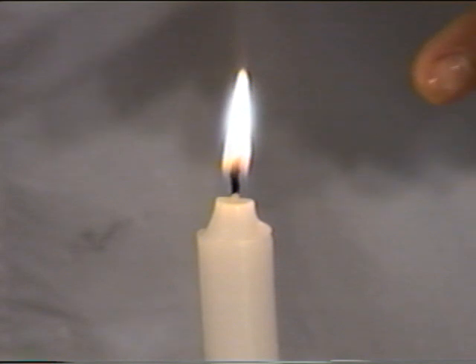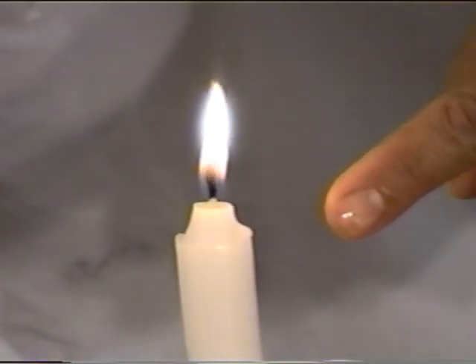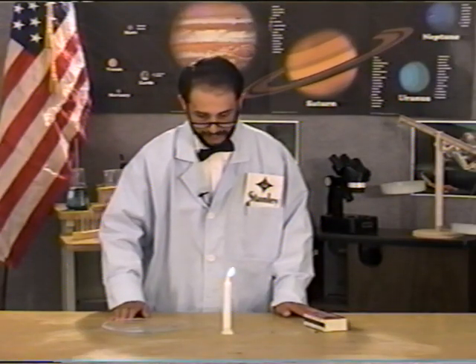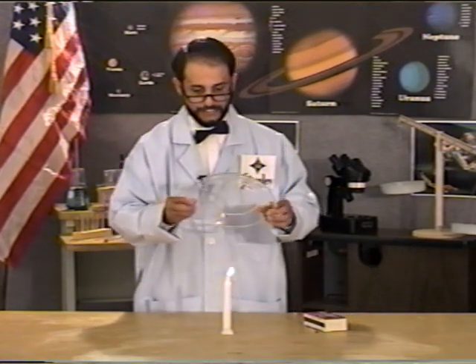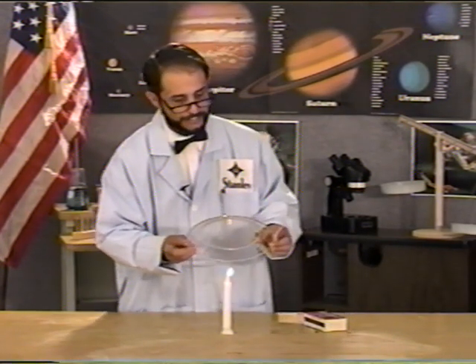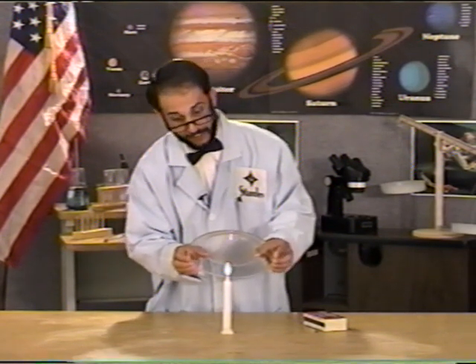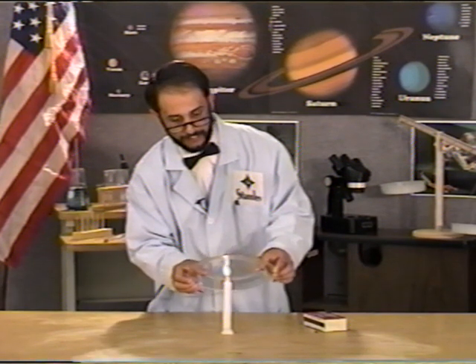And we see the candle is burning and wax is melting. You see that drip? There's a physical change with this amount of heat. Now let's hold this glass plate about a decimeter over the flame. We notice no change right now, no change yet. Have to be careful with it. After all, the candle's very hot.